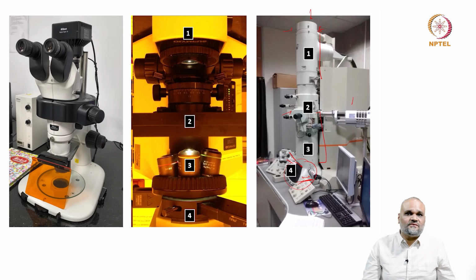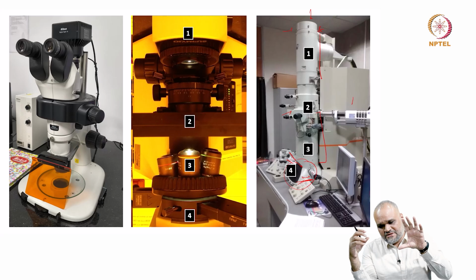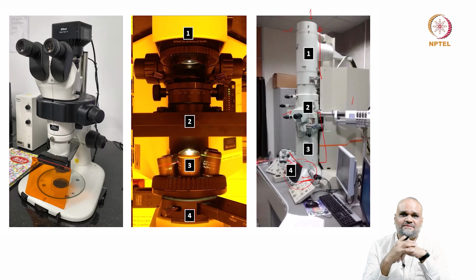You can think of the old school TV screens, where you had cathode ray tubes or monitors, where you have a cathode ray tube and then you have a vacuum chamber and you apply an electrical signal and images are displayed on the screen.